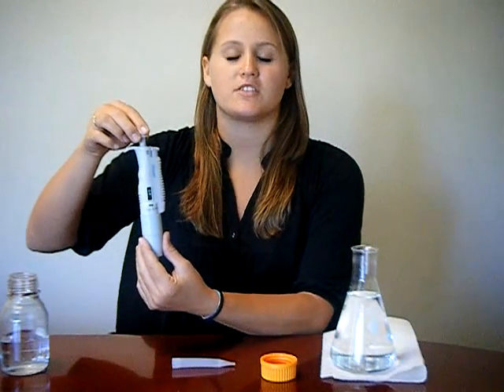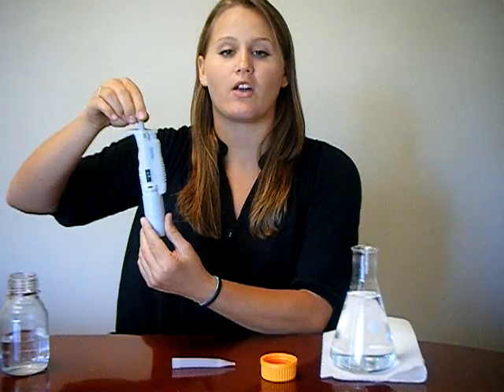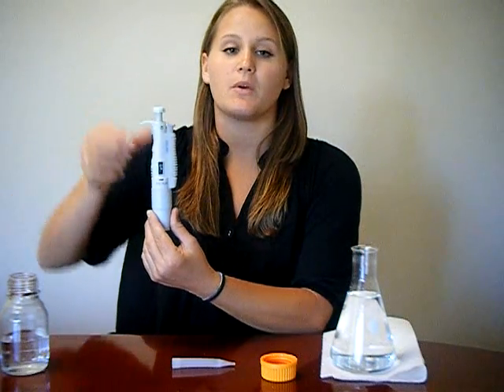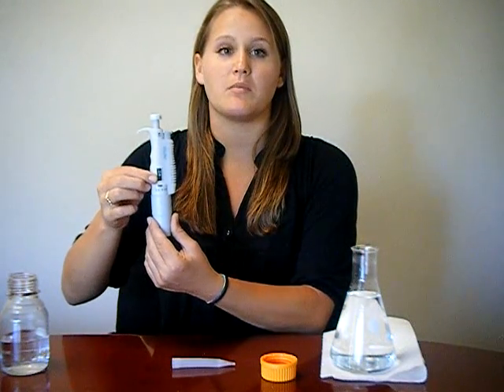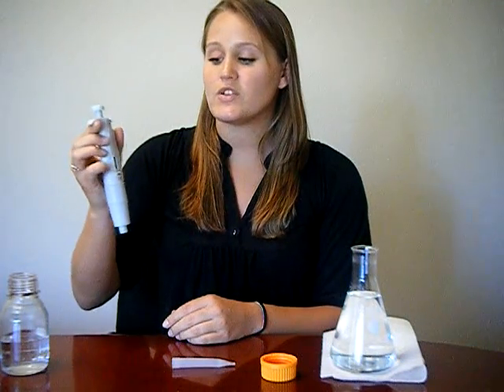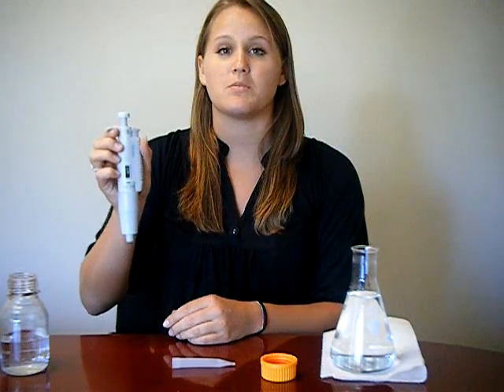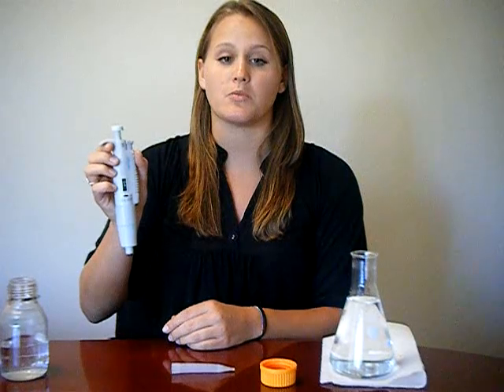To adjust the pipet to your desired volume, the plunger on the top is rotated clockwise to raise the amount and counterclockwise to lower the amount. The window on the side clearly displays the amount in milliliters. It is important to notice that on every single pipet, you must never exceed the volume threshold, as this will diminish your accuracy and possibly ruin your machine.